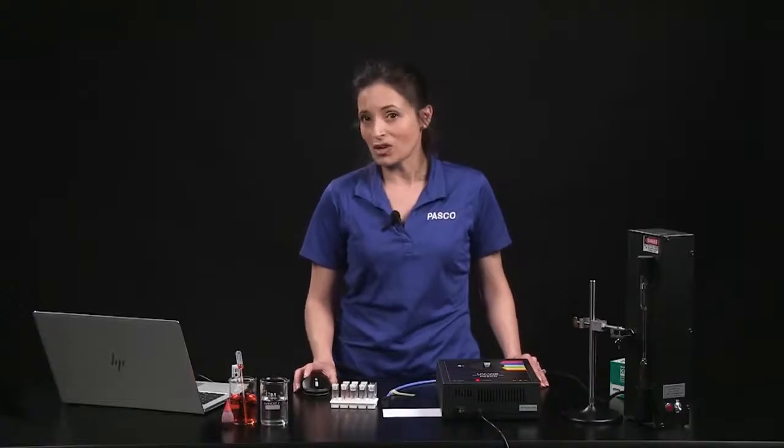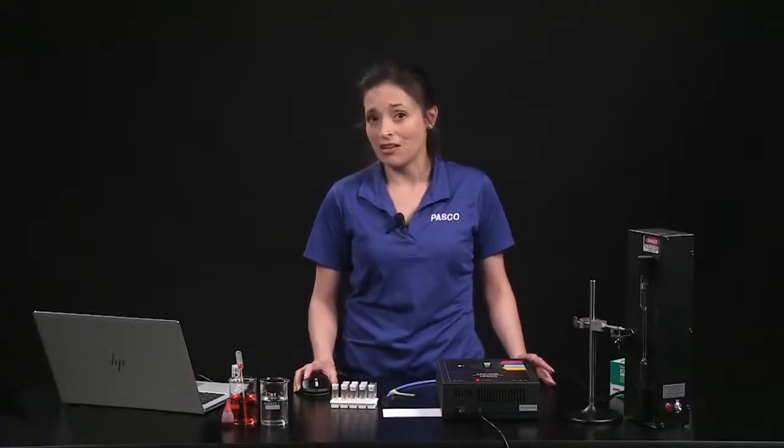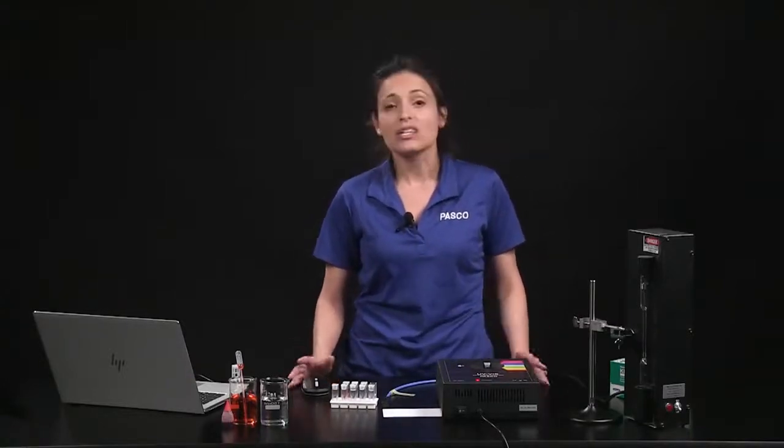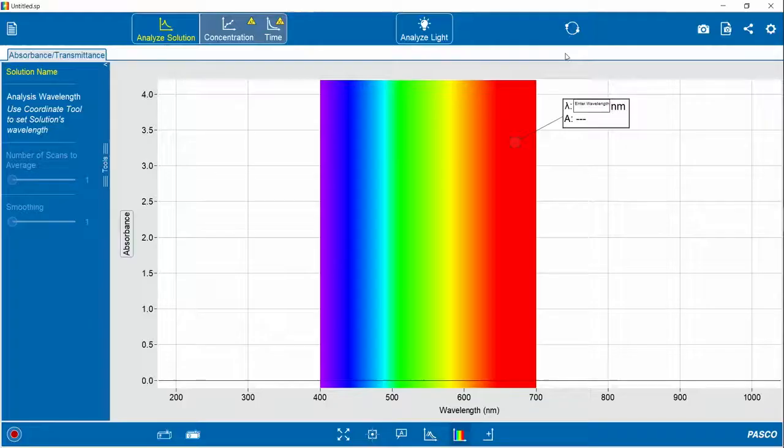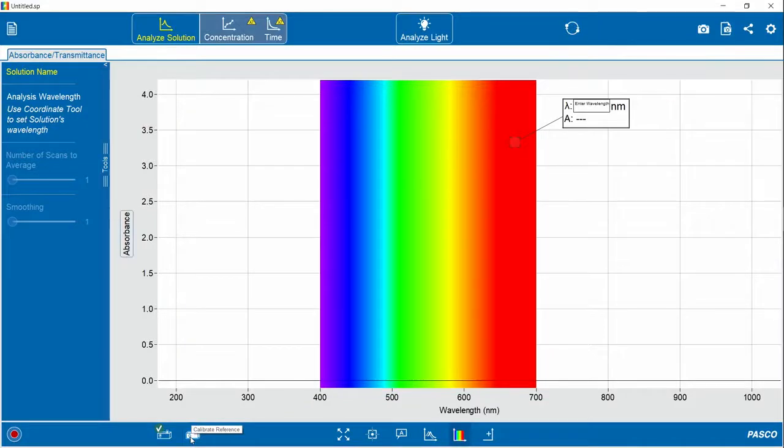To investigate solutions, start by calibrating the spectrometer with your blank, or the substance that you use as a solvent. I used distilled water for the solutions I'm using today, so that's what's in this cuvette. In the software, click Calibrate Dark, and then Calibrate Light. And now you're ready to analyze solutions.